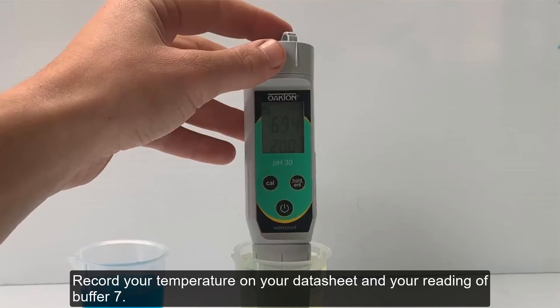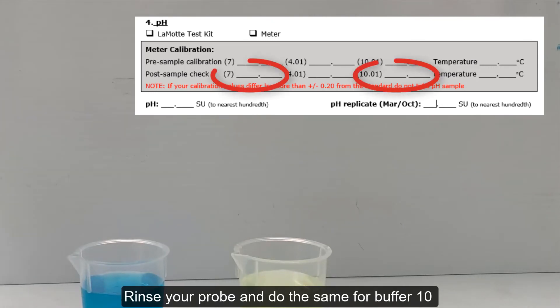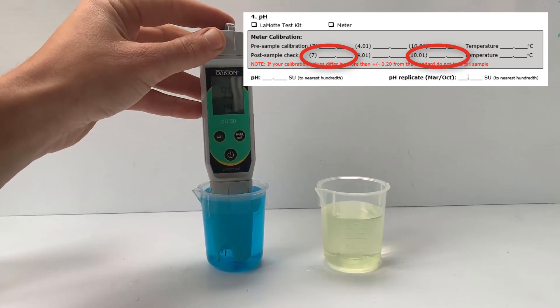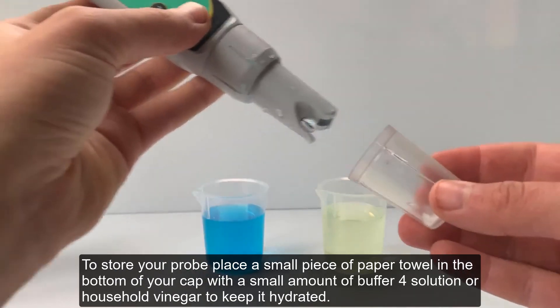Record your temperature on your datasheet and your reading of buffer 7. Rinse your probe and do the same for buffer 10. To store your probe, place a small piece of paper towel in the bottom of your cap with a small amount of buffer 4 solution or household vinegar to keep it hydrated.